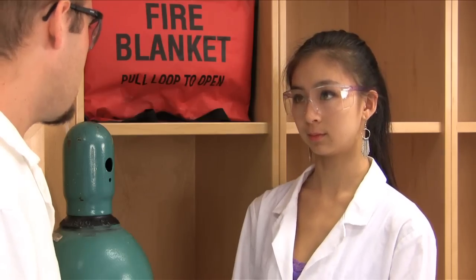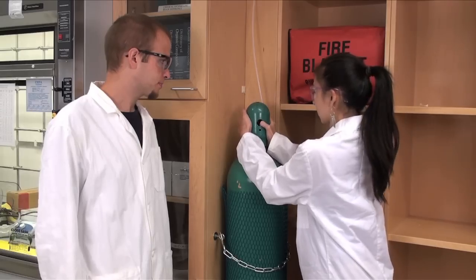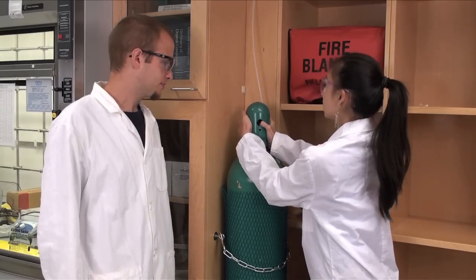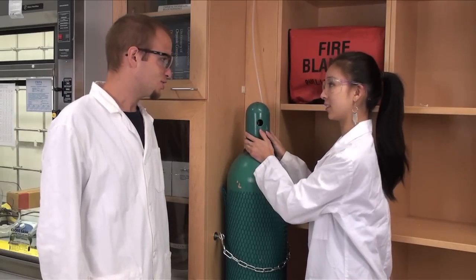Okay, now let's take the cap off and connect it. The cap's stuck. I'll go get a hammer. Gidget. That's probably a bad idea. Yeah. The cap protects the valve, which is the most sensitive part of the cylinder.